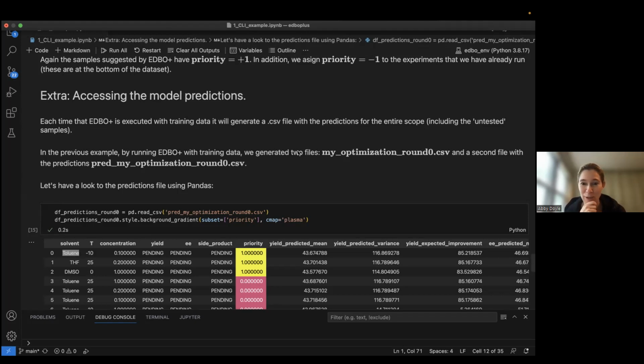It's a good question, Ampofo. We haven't quite run into this yet, although we did have one collaboration with someone in the Department of Defense who used it, and we cited our paper. The referees definitely did ask questions that got into the details of EDBO plus, such that having some knowledge of it was helpful in responding to referee comments. But it's something we haven't yet had many experiences with.